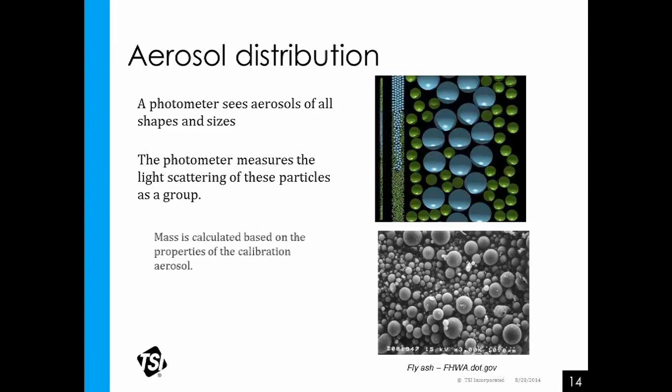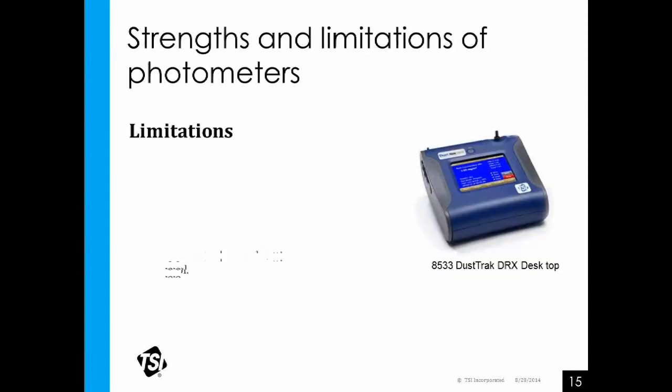These aren't going to be used as reference methods for pure OSHA exposure monitoring to permissible exposure level. It's very accurate measuring an aerosol. It's very precise measuring the aerosol levels, but the accuracy is determined by how it's calibrated to the actual density and size fraction of that aerosol that it's being exposed to. So, as we're talking, there's some limitations to this. One of those limitations is really just the calibration aerosol.